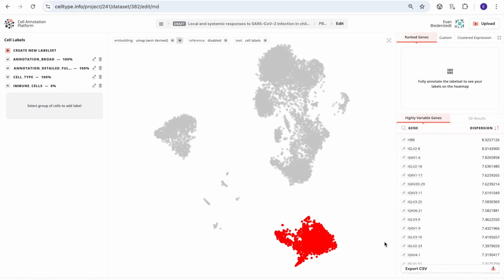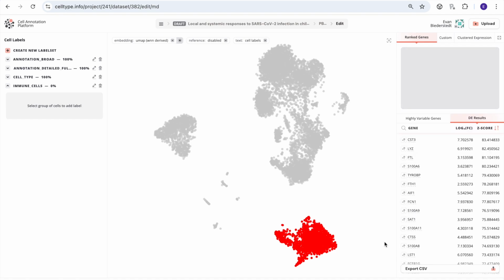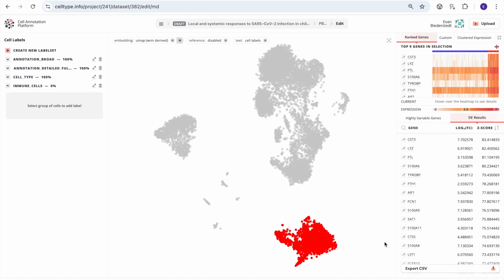This is a standard procedure whereby the selected cells in red, I want to see which genes are more expressed or less expressed than some baseline. And the baseline is a population of other cells. So the standard thing to do within the field is to use other cells within the data set. And in this case, if there's over 400,000 cells, the assumption is that that should be enough statistical signal to measure what is special about these cells in red versus the background.